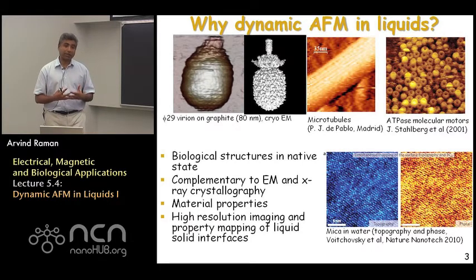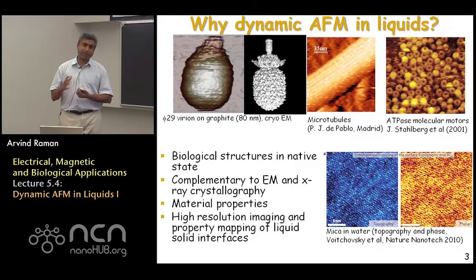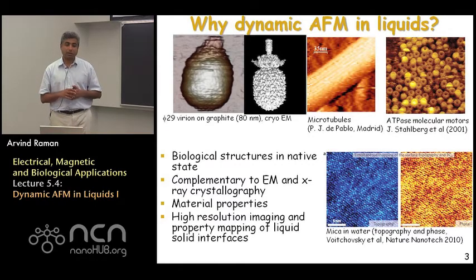So whenever one wants to study not only the topography of biological samples, but also mechanical properties by doing indentations or other forms of force spectroscopy, the atomic force microscope has an unparalleled advantage over other ways of imaging very small objects. Another growth area where the AFM is becoming useful in liquids is the study of liquid-solid interfaces in and of itself. There are a lot of interesting physical processes that occur at liquid-solid interfaces that really need to be understood, and really the only instrument out there that allows us to do it with such resolution, both in space and in forces, is the atomic force microscope.